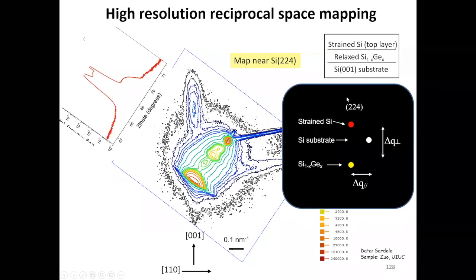In addition, you got those peaks that are overlaid there, additional peaks coming up that you are not expecting. They are actually the cause of this broadening. And now when you talk to the crystal grower, they say, yes, we wanted to increase the percentage of germanium in this layer so it's relaxed. We gradually increased the percentage until you get this number here that we found out. With these peak positions and the high level of accuracy we have in the reciprocal space, we were able to identify all the lattice parameters in the growth direction and in-plane direction. We could get the strain information. We could calculate the percentage of germanium that is in this layer, and so on.